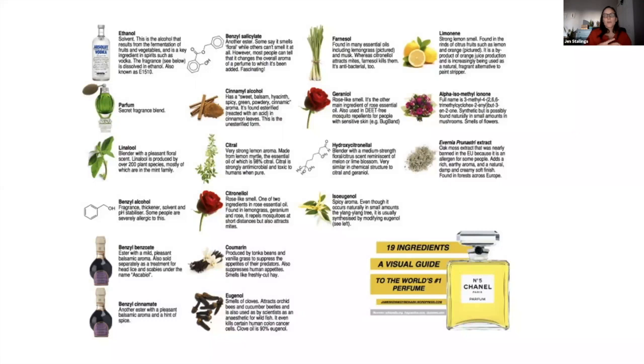You could spot a TLC plate with geraniol and spot a batch from last year that smelled perfect, and you could see if geraniol is present in your new batch, the same as it was in the old batch. So these are different things that you can do with TLC because it's low cost, it's pretty effective, and you don't need a lot of equipment for it.